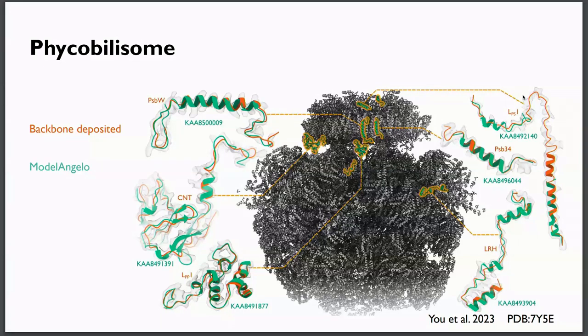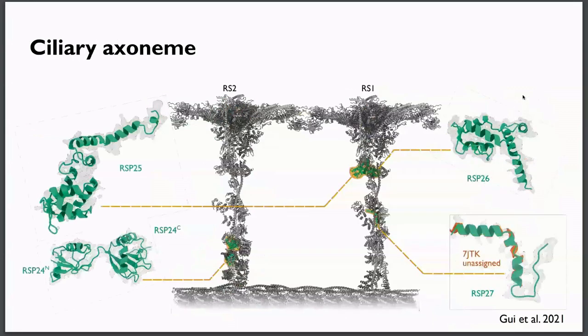confidence. And also, you saw Alan earlier today show the ciliary axonemes. And these also have a few unidentified proteins still. And we were also able to do the same strategy and get these proteins, and we can confirm these with mass spec data as well, with Alan's help, to make sure that these are correct.